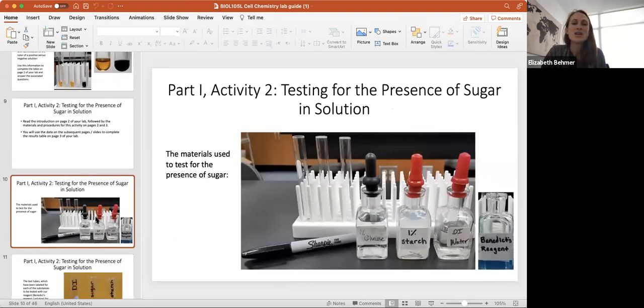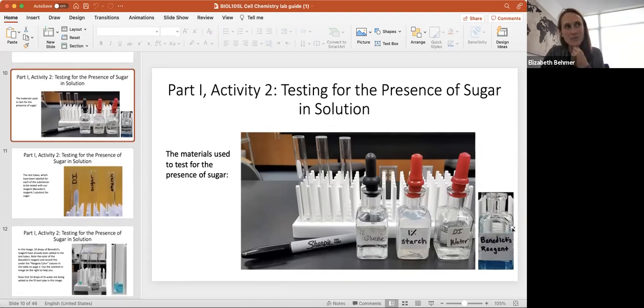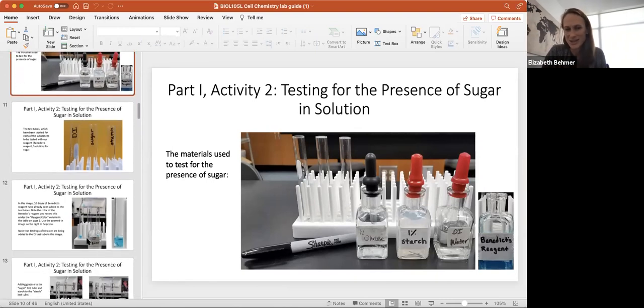The same thing occurs detecting for the presence of sugar. So we use the same kind of 3 solutions. Distilled water is our control. We'll test for starch again and then test for glucose. But now the difference is that we're using a different reagent because each reagent tests for a different substance. So for example, the IKI, which is what we just tested, will detect starch in solutions. The Benedict's reagent, which is in blue here, let's see what Benedict's reagent tests for.